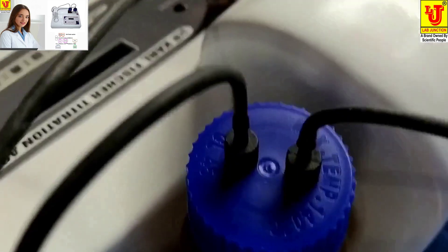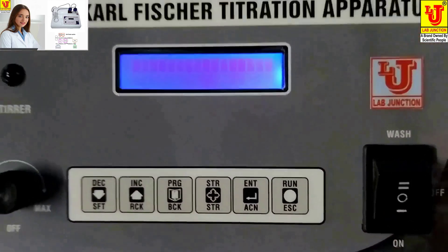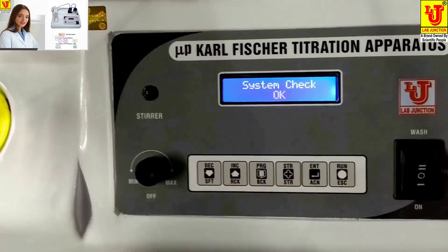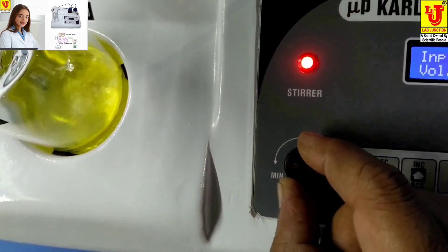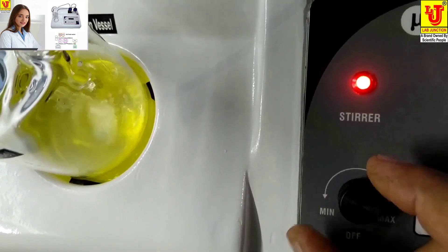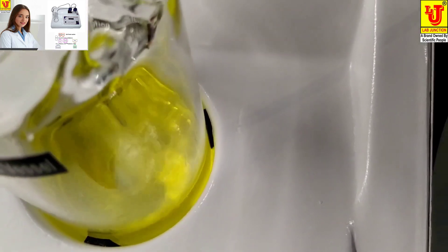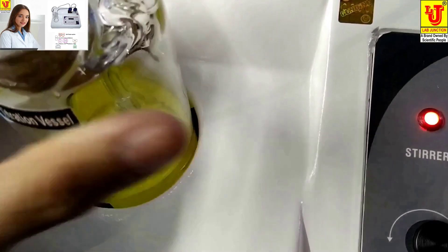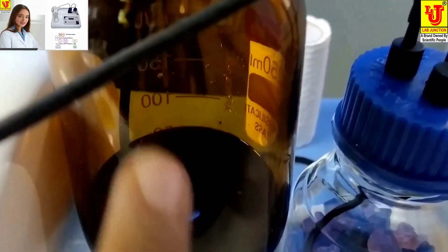Now, how to use this machine: switch on the machine. This is the Magnetic Capsule stirring speed — minimum to maximum. You have to put 150ml of dried Methanol in this bottle, and feed the Karl Fischer Reagent in this bottle.